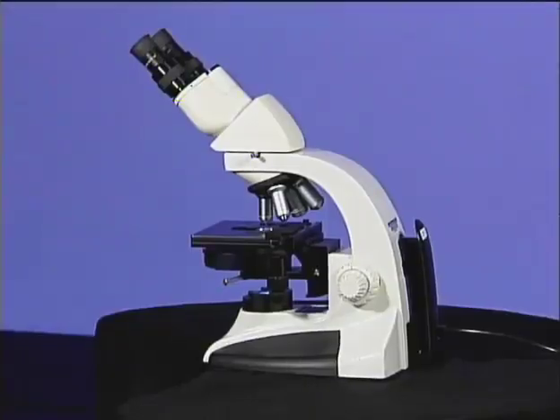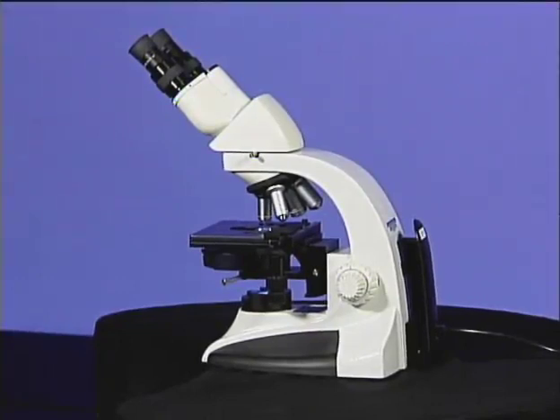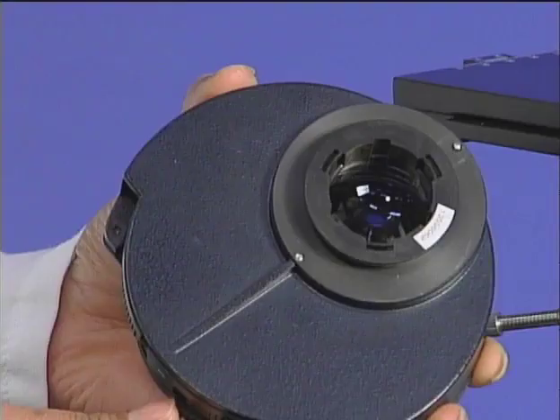A microscope, however, is a complex magnifying device and contains several distinct lens systems. As we have seen, one of these, the condenser, focuses and concentrates the light from the illuminator onto the specimen.